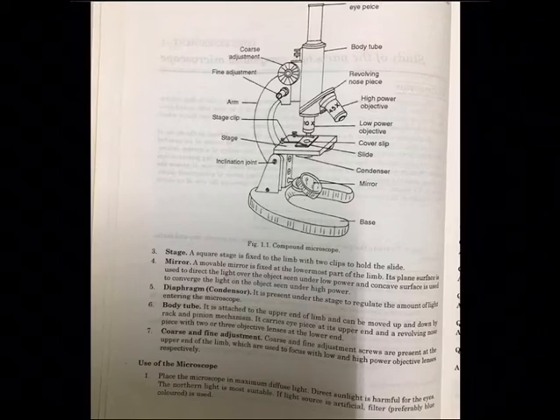And then use only fine adjustment at this stage. Once you have fixed the objective lens, do not use the coarse adjustment. You must use only fine adjustment, particularly when the objective lens you have kept is high power, that is 45X, because the gap between the objective lens and the slide will be very, very narrow. So if you operate coarse adjustment, what happens? The slide will be broken. So take care that the slide will not be broken. So what is it that you have to use? Fine adjustment only. Always observe with both eyes open.